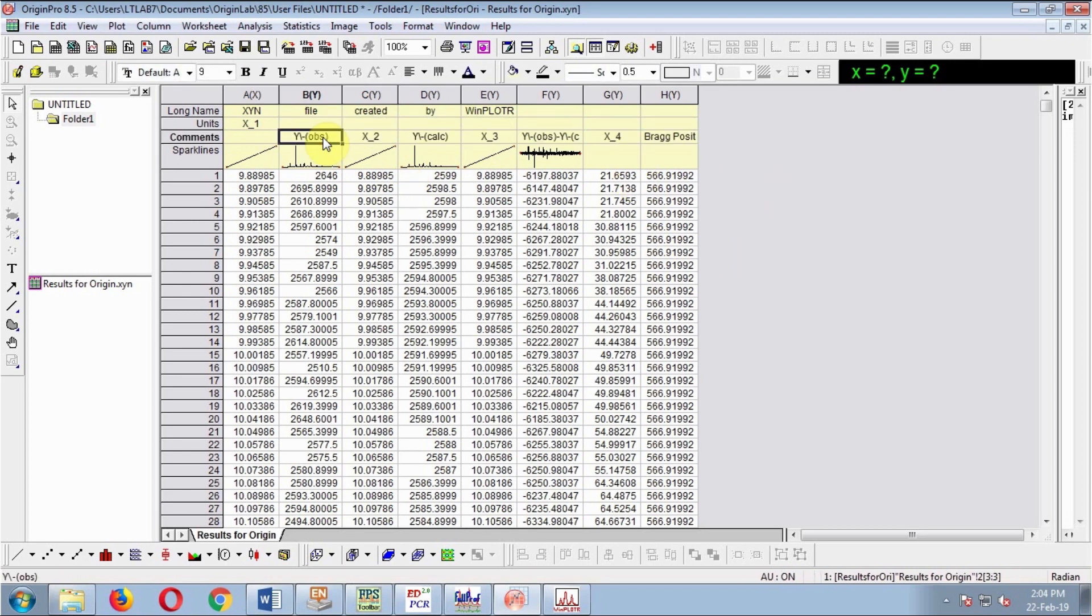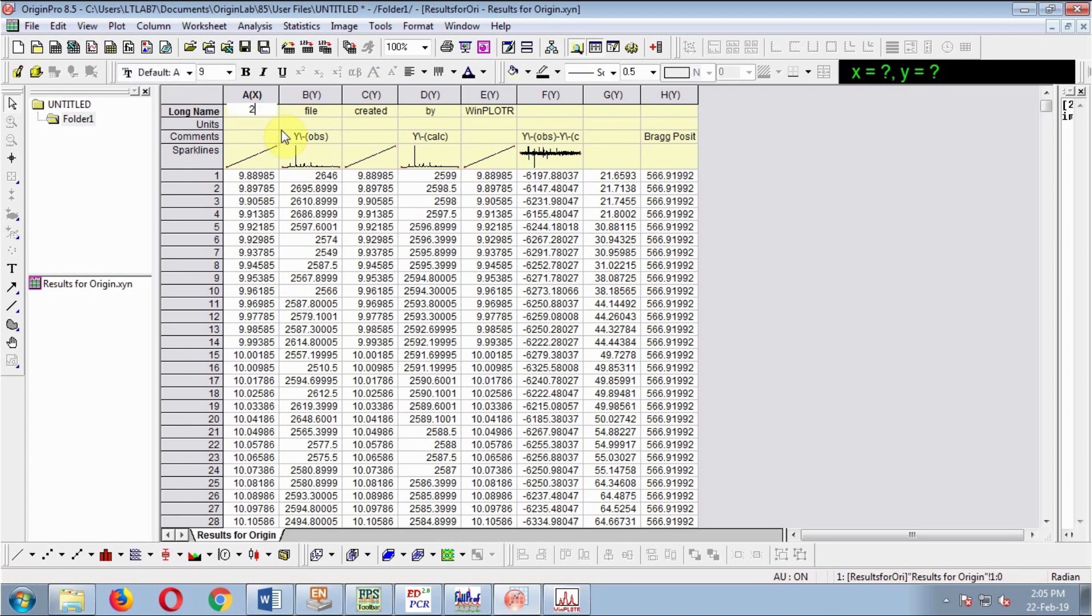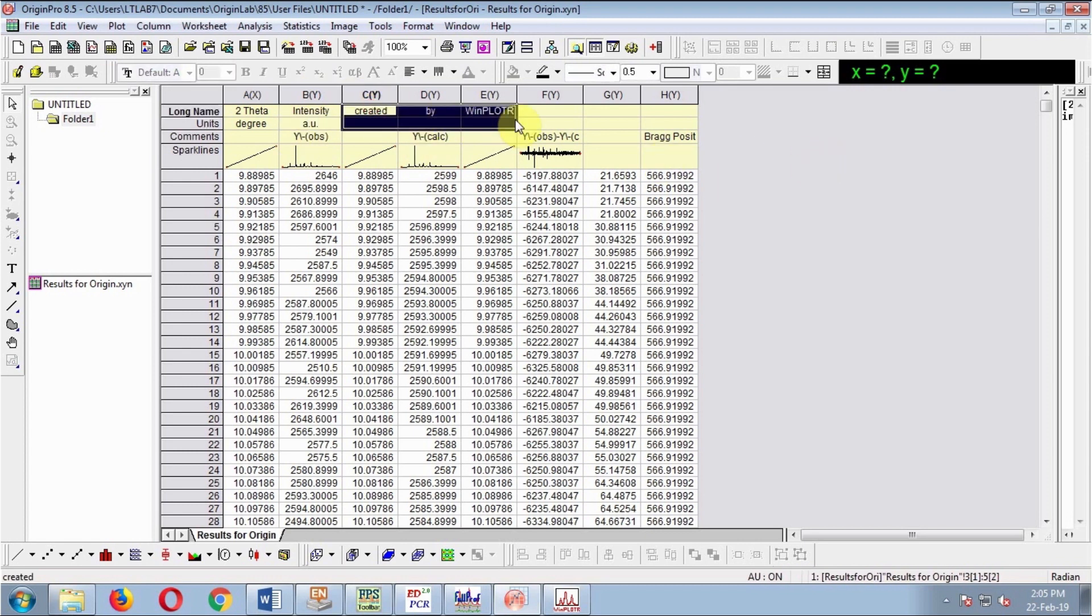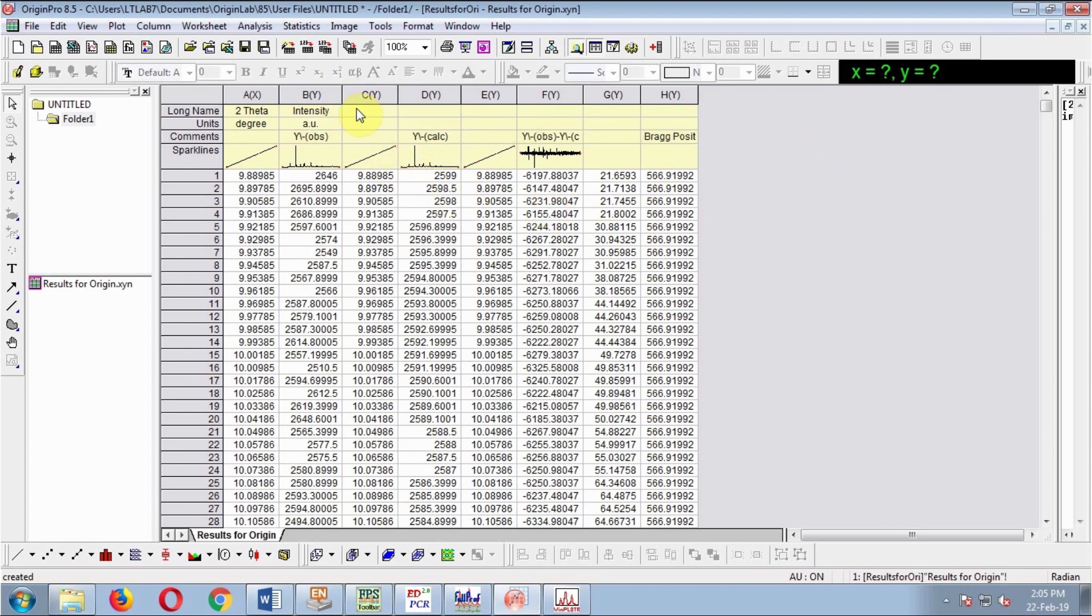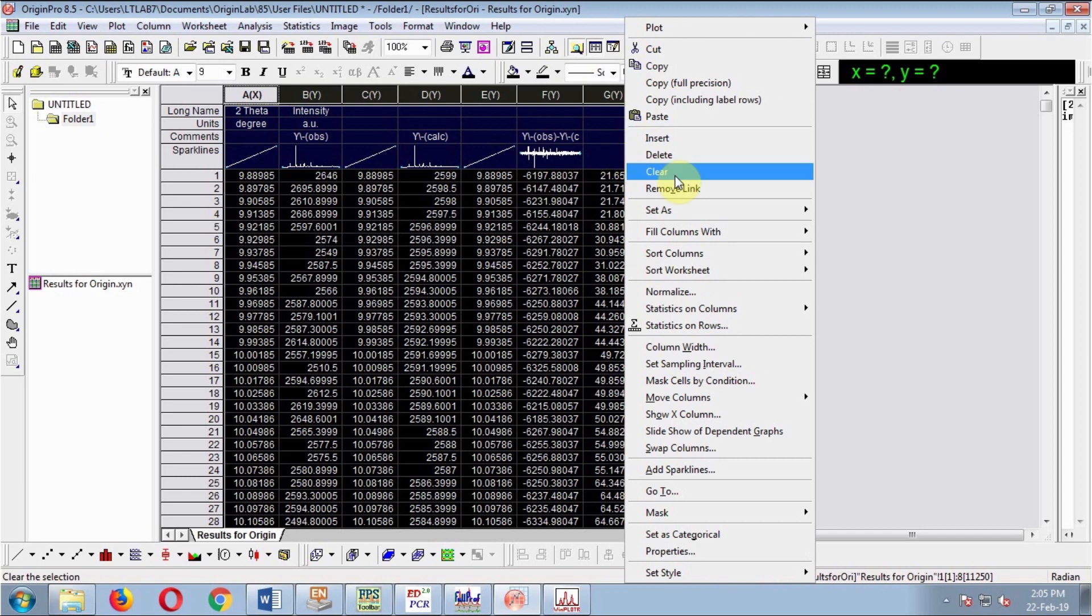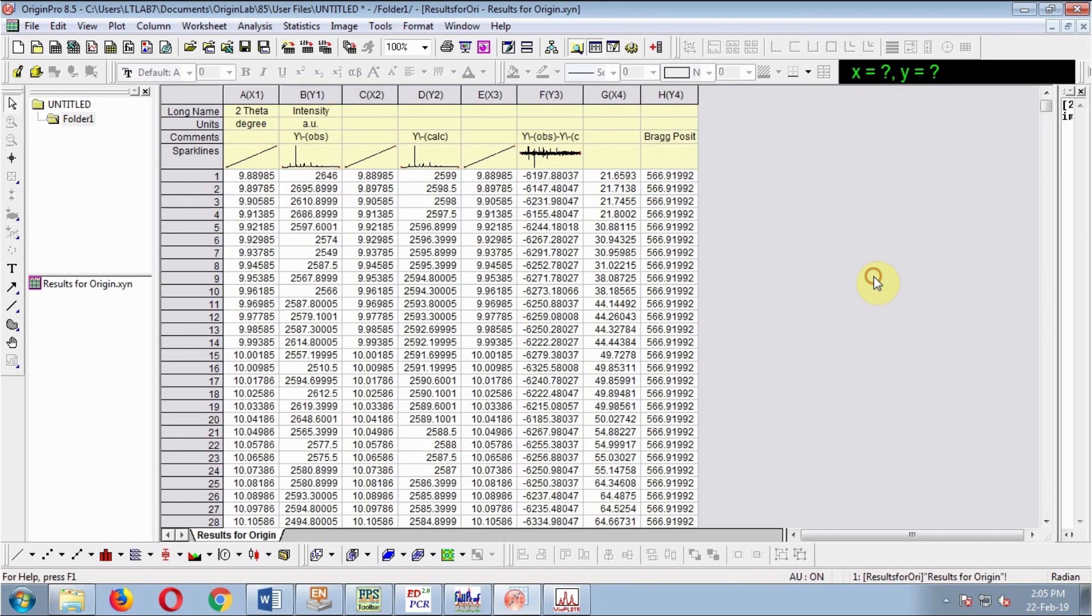Delete unnecessary things. 2-theta, the unit is degrees. This is intensity in arbitrary units. Other things are not required. Select all columns and set as XYXY.